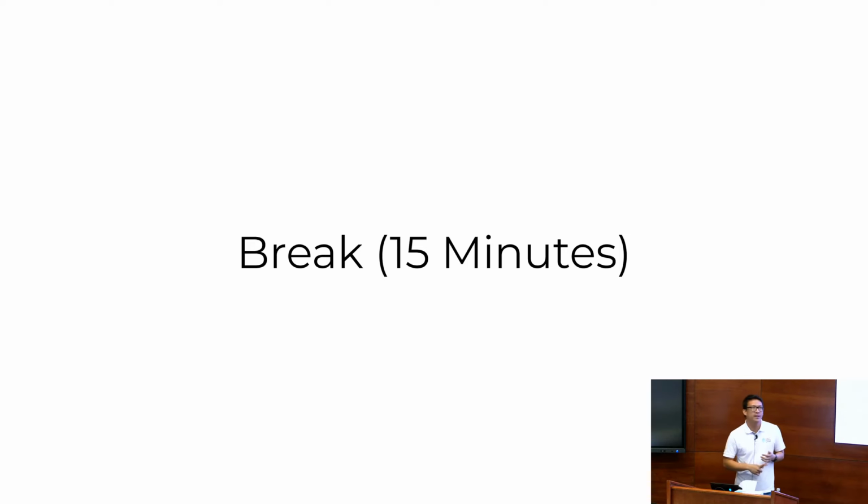So the nice thing, or a few words about Avizo. Avizo is a commercial product. Okay, so KAUST has a license. So while you're inside the KAUST network, you can use it. And as I said, the AI tools only work for Windows right now, and you need a GPU.